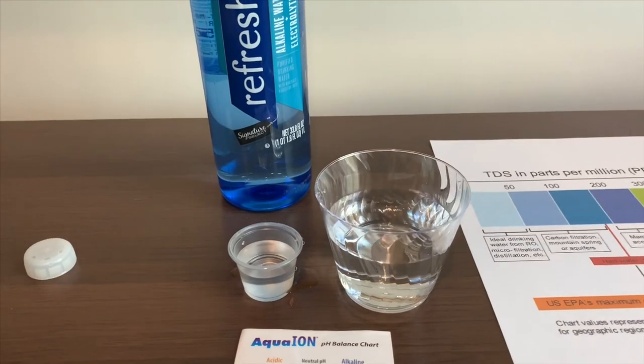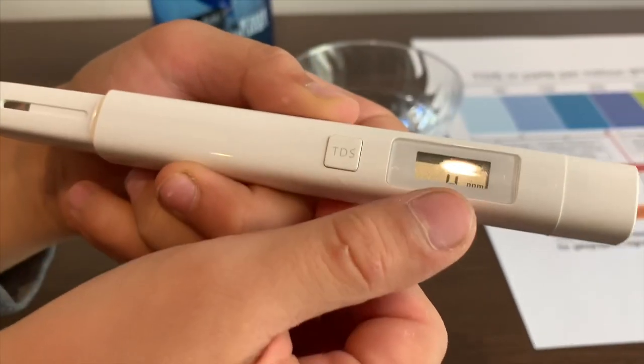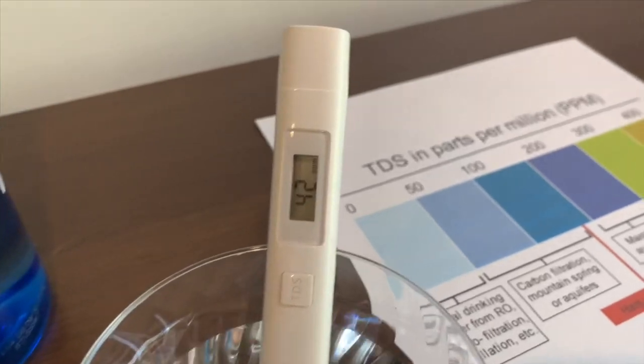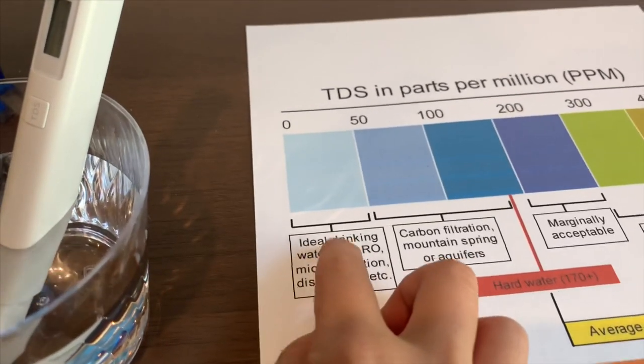First, we're going to test the TDS level. Let's turn on the TDS tester. Make sure it says 0, and let's put it in. 42. That is ideal drinking water.